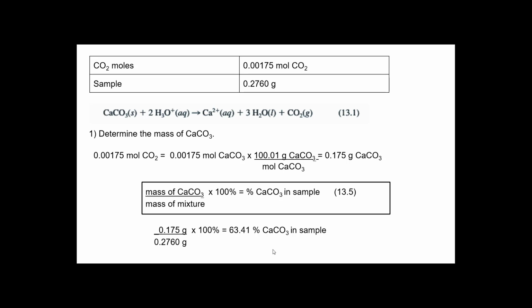This is not a difficult lab. If you were in person, there's probably 85% of the class that is really irritated with the first trial, because it usually takes 40 minutes for everybody to get it to where they can do the first trial. And then the second one, pretty fast. But I think it's even more annoying for students because this reaction is 5 minutes long and it's 40 minutes of prep.